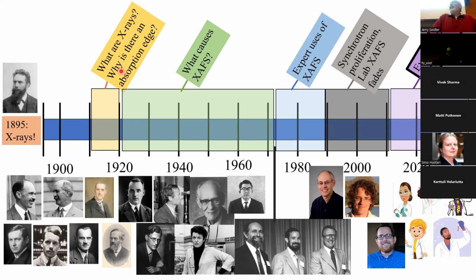I think there are many answers to your question. One way to start is to ask how to find more users. The technique is certainly underutilized. It is not the case now that everyone who gets a bachelor's degree in chemistry would know what XAFS is and what it might be used for. In the past, it made sense that that was not part of the standard curriculum because not every undergraduate gets to go to the synchrotron.